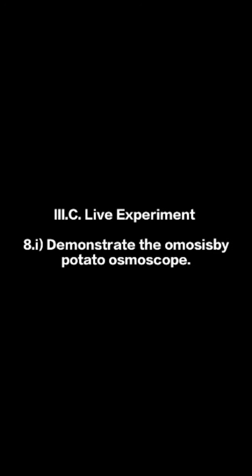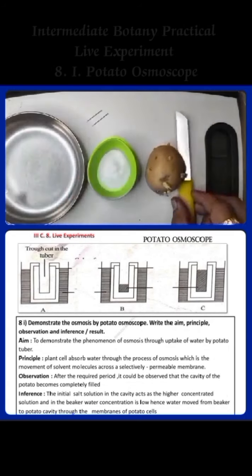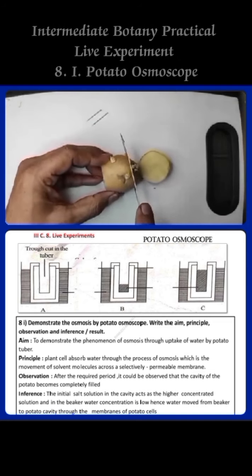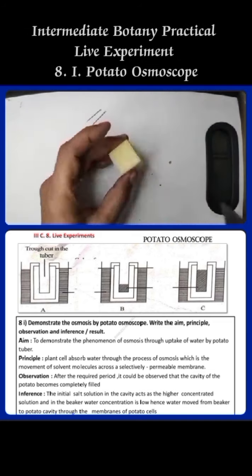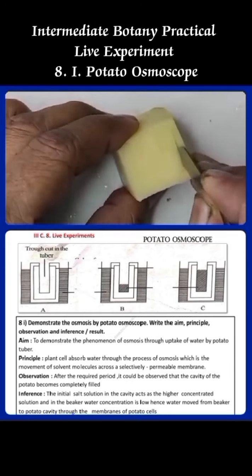Third, 8 live experiments. 1. Potato osmoscope. Demonstrate osmosis by potato osmoscope. Aim: to demonstrate the phenomenon of osmosis through uptake of water by potato tuber.